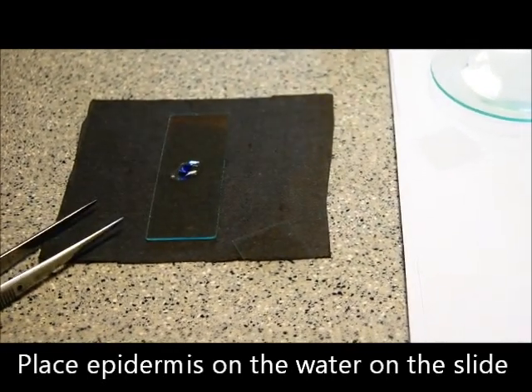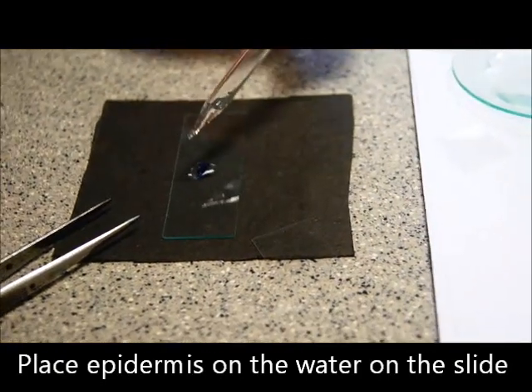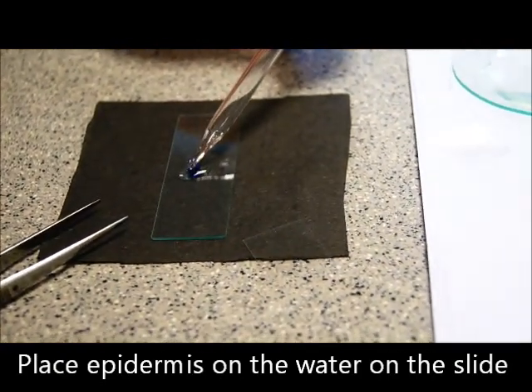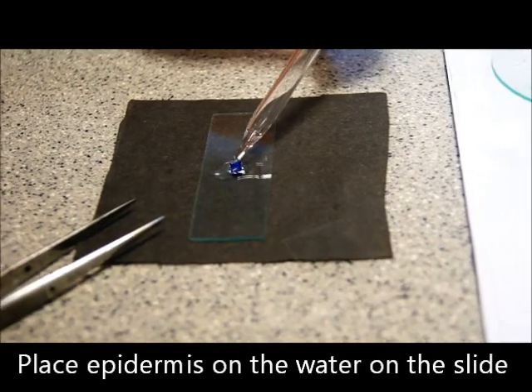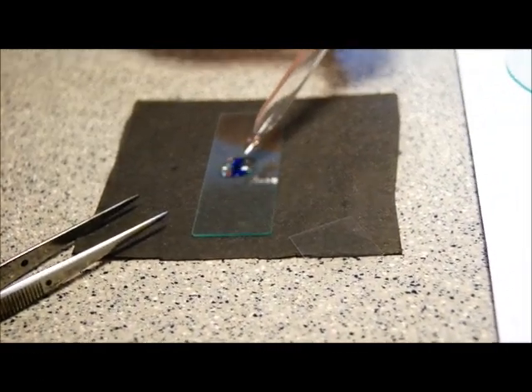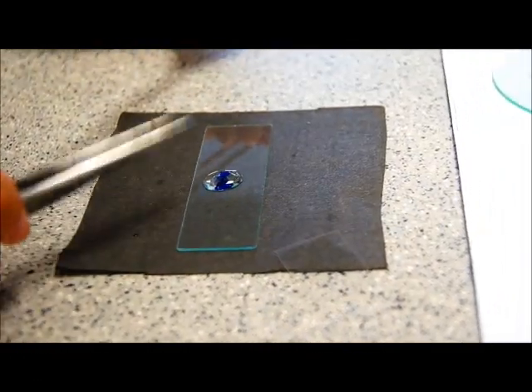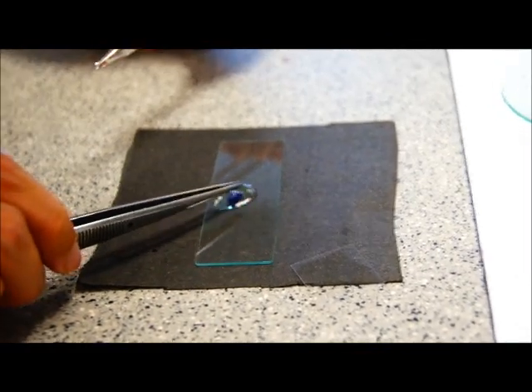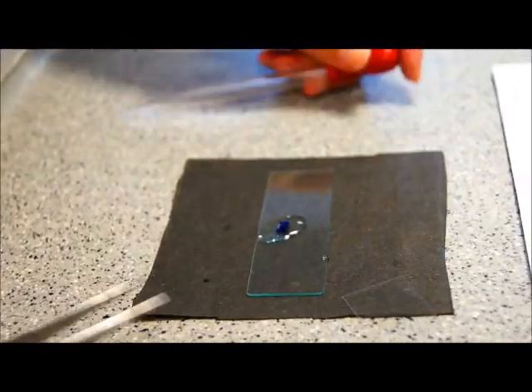You can press it down a little bit to try to submerge the piece of epidermis. If it doesn't get submerged, that's fine. You can add another small drop of water on top of it. And even after this, if it's not submerged, just push it a little bit more. And next, this is the part where you cover the sample with a cover slip.